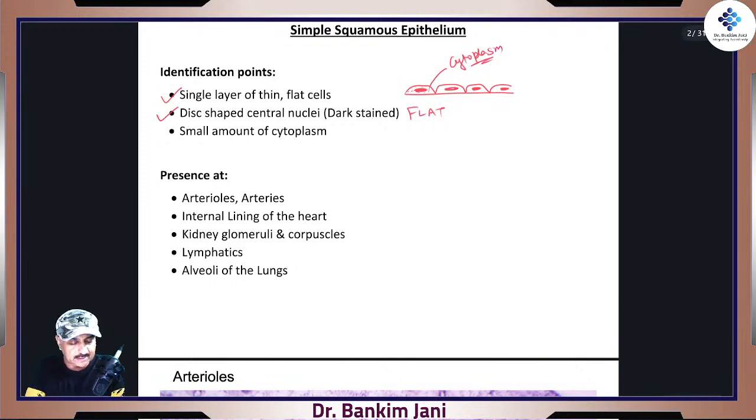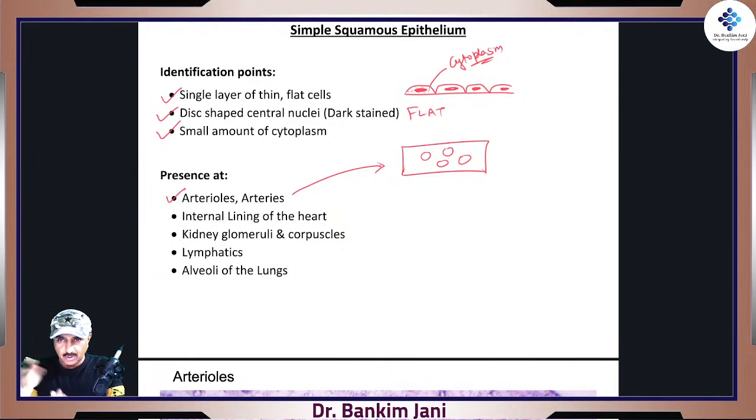Where do we really see these things? These will be the characteristic. We'll watch it in arterioles and arteries. Now see, when we'll be watching the arteries, it's not so that the artery will be isolated and then the section is taken. Some tissue is sectioned and then it is watched. So if we say arterioles, you'll be watching several arterioles because they are actually in the tissue. So amongst all the tissues, there will be arterioles. So we'll be focusing on those arterioles, small arteries.